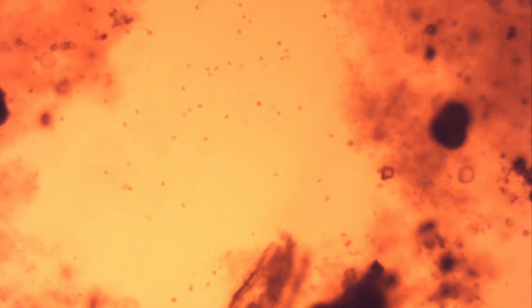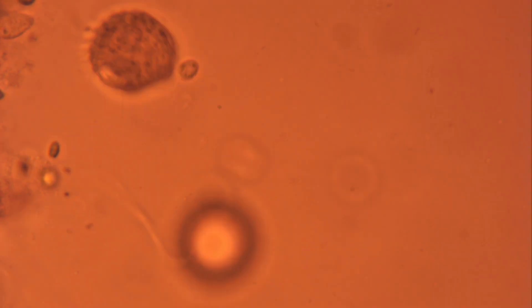There are lots of bacteria in this sample, however what we mostly see here are much larger protozoa. The bacteria are smaller and much harder to observe with this camera. They will respond largely the same however, I just felt the need to clarify this. Maybe I'll do a bacteria specific video at some point. I might even try to isolate some phages if I can get the appropriate stain and am very lucky.